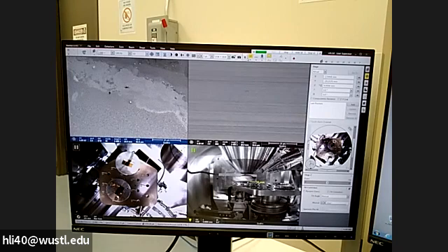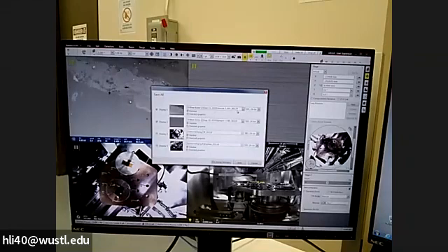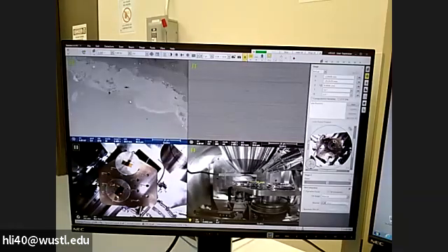Okay, we can shift and pause, pause both images. Then you go to File, Save All. It will automatically add an underscore 001 to the file name. The next image we record will be 002, so it is automatic. You don't need to worry. You click Save. Okay, I can pause off.